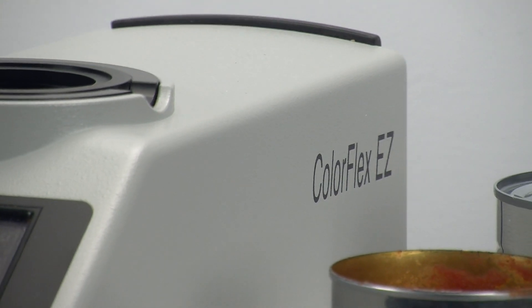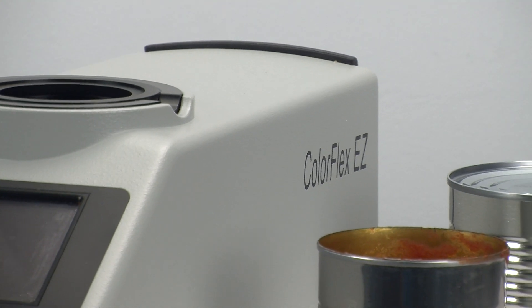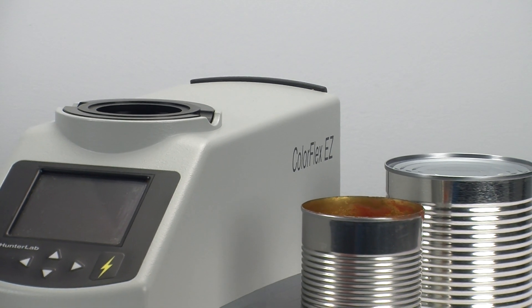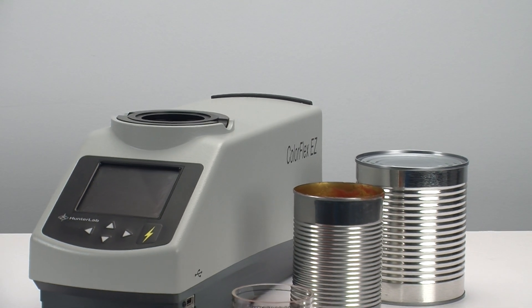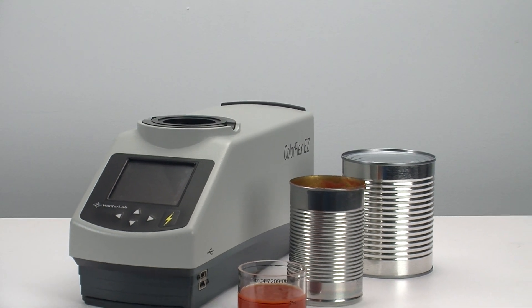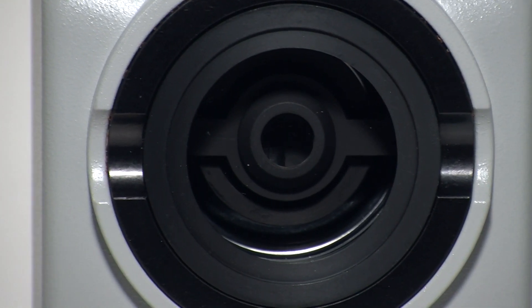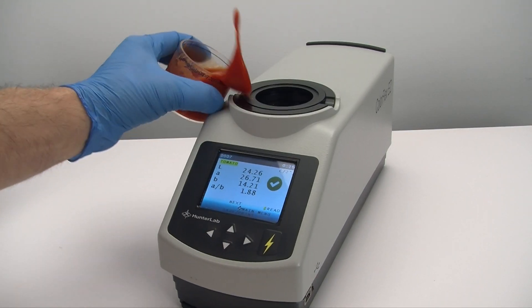The ColorFlex Easy Tomato is loaded with other features as well. Physically, it is ruggedly built, and with its compact footprint, can be placed almost anywhere. With fully sealed optics and control panel, you are protected from the inevitable sample spills.